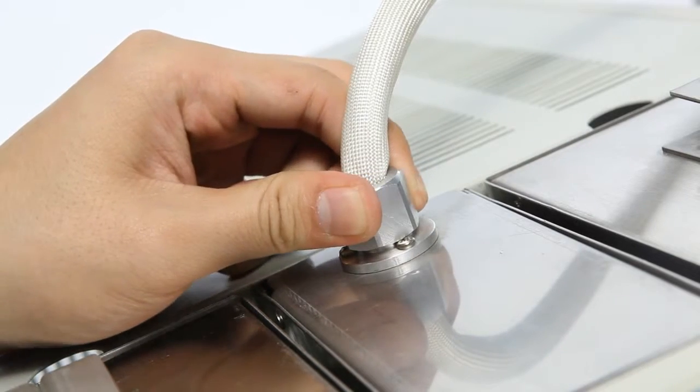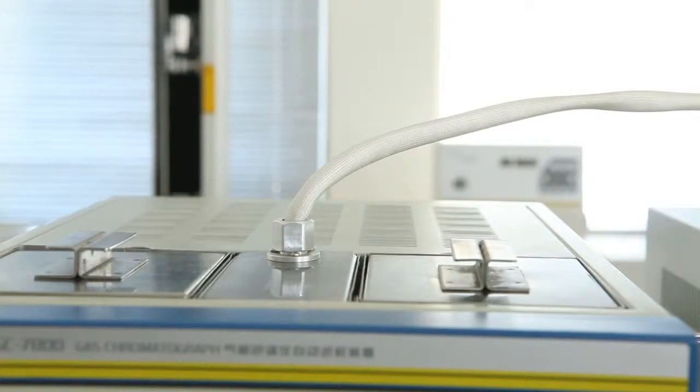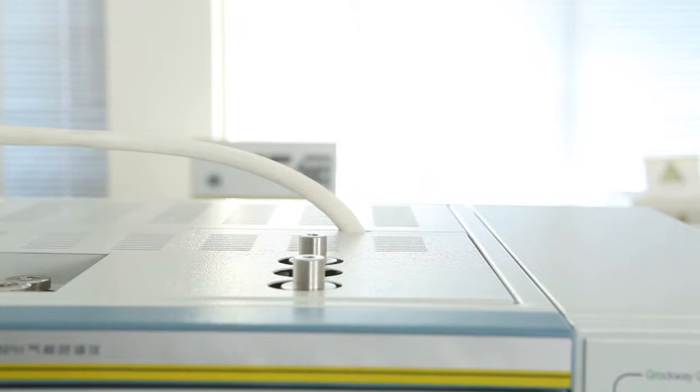The sample transfer line has been chemico-physically treated and is temperature controlled in order to prevent sample condensation and absorption. This sophisticated design increases the detection limit and significantly improves the accuracy of test results.